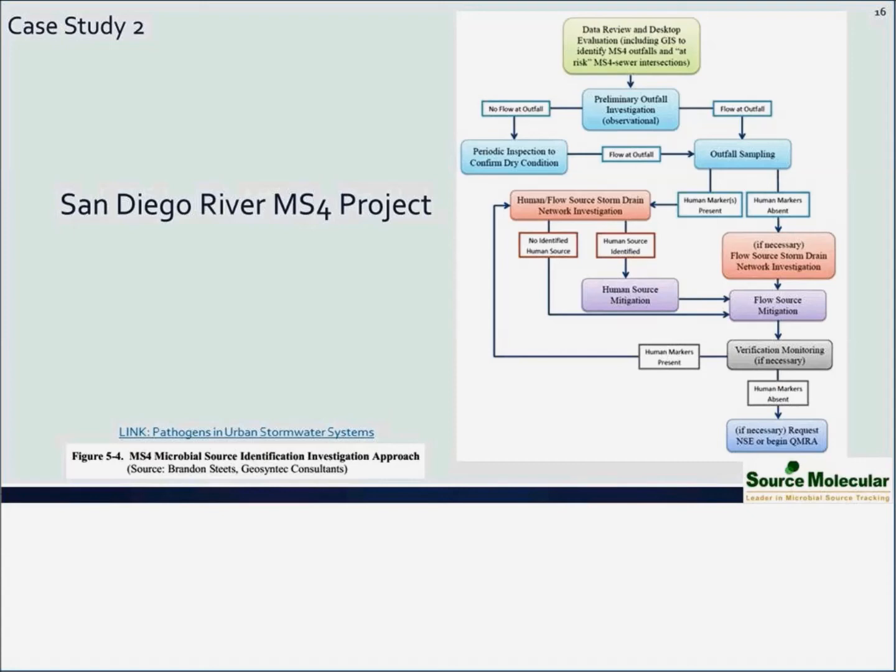Those are the two most commonly used ones. Those are the two recommended in the California guide document, and usually it's good to do both genes, especially in septic, where you don't know how much of each of those genes are in the starting sewage. I hope that answers it.